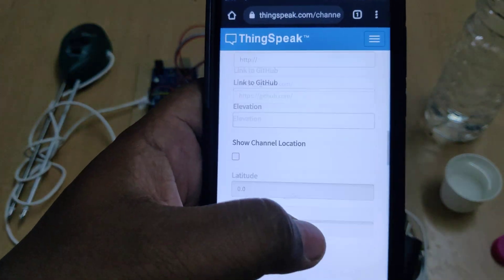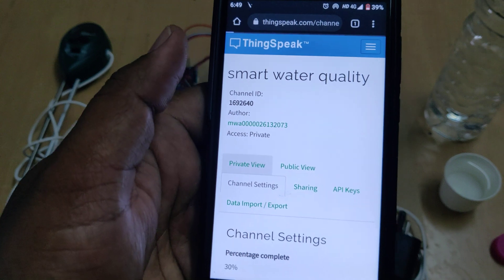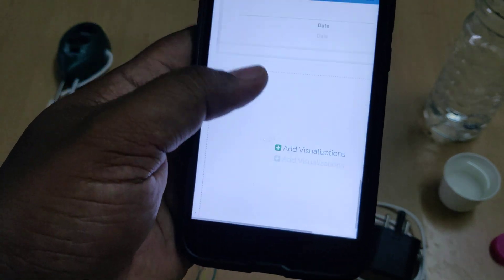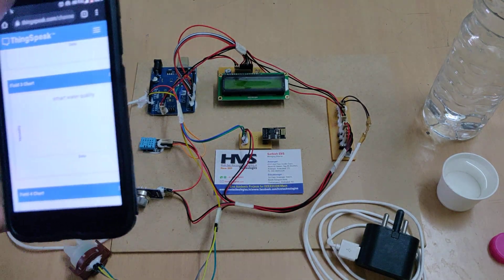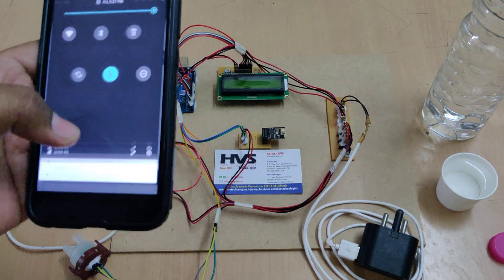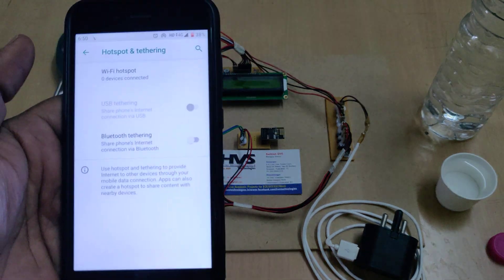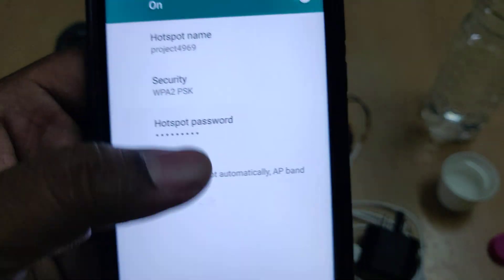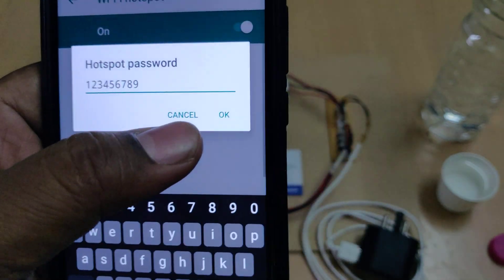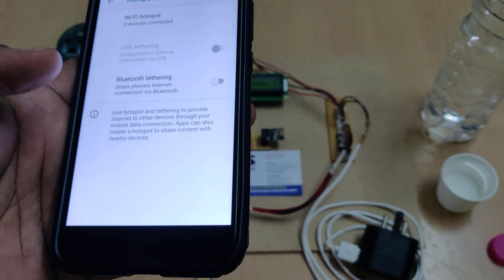Again, do not delete the channel. After clearing, go back to the private view and you can see that all the previous data has been erased. Now, before switching on the device, go to your phone's hotspot settings and change the hotspot name to 'project4969' with the password '123456789'. Then enable the hotspot along with mobile data.